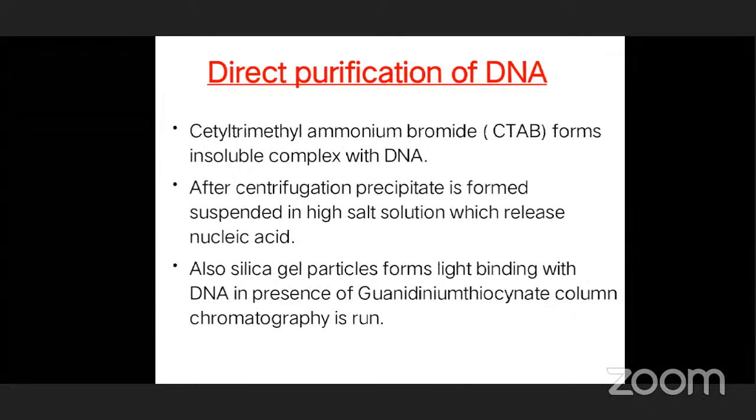Next, 20% sodium dodecyl sulfate. This is used for the removal of WBCs. Next is proteinase K. This is used for the removal of proteins or degradation of disulfide bonds. Also next is ethanol, and then Tris phenol, for removal of cell debris, carbohydrates, lipids and protein.